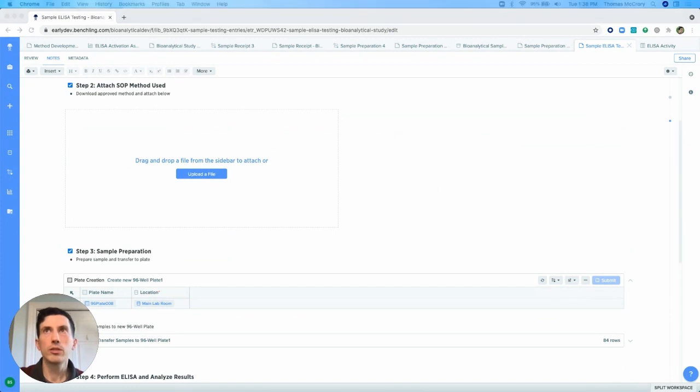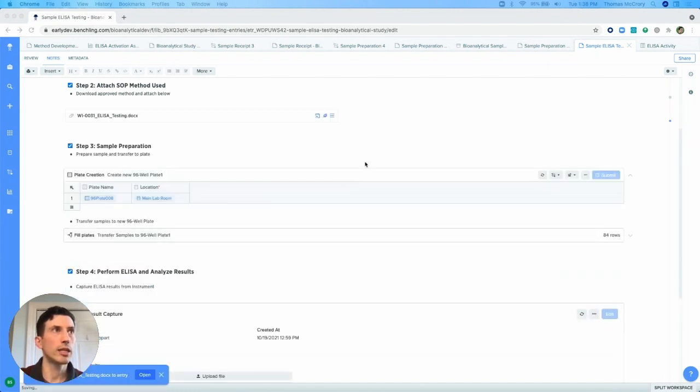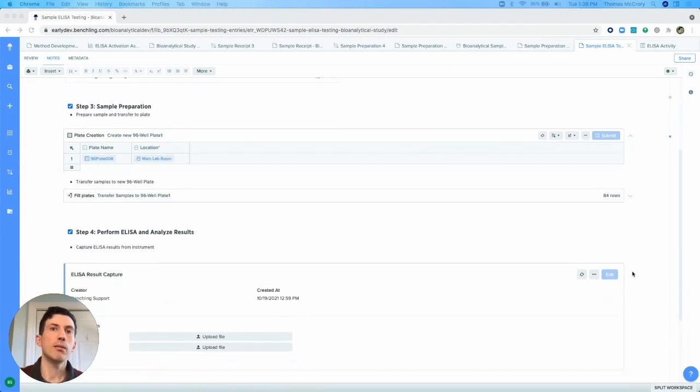All right. So once she downloaded that method, she would then drop that into her document, establishing which method was performed, and be able to have easy reference as she's performing the assay. One aspect of this, because her workload may be large, is the ability to automate some of these data capture processes.